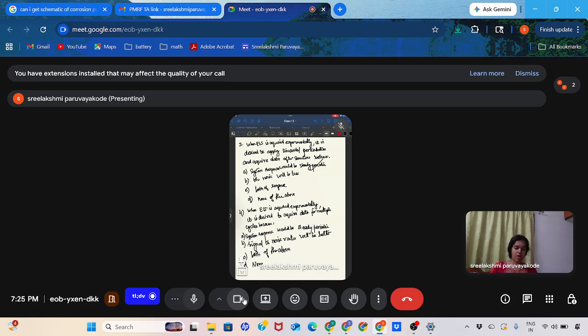So when we are collecting EIS, we have to do multiple cycles.